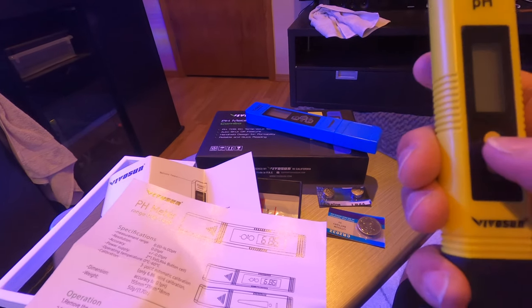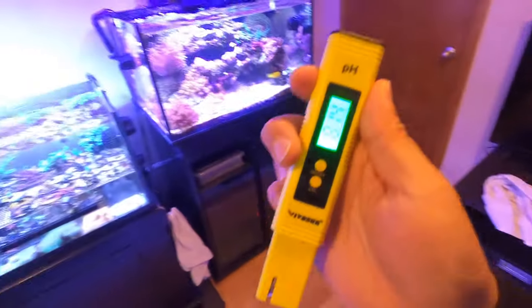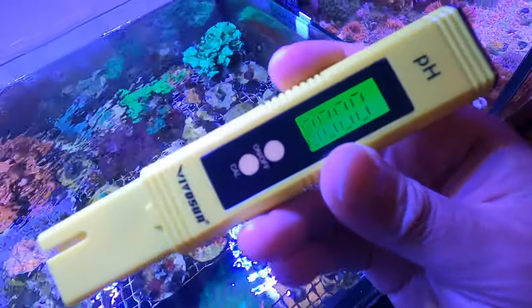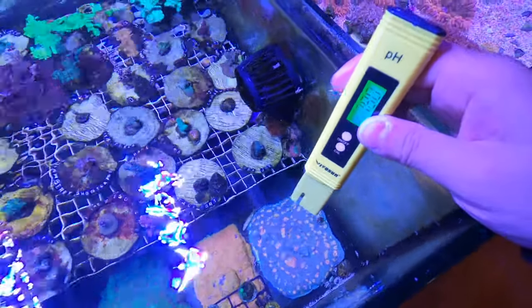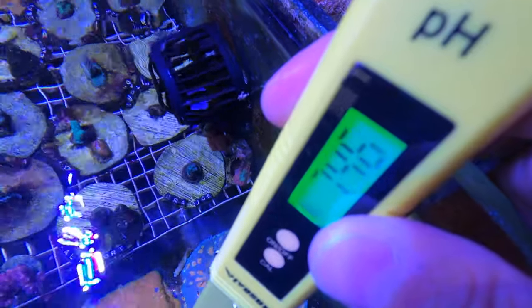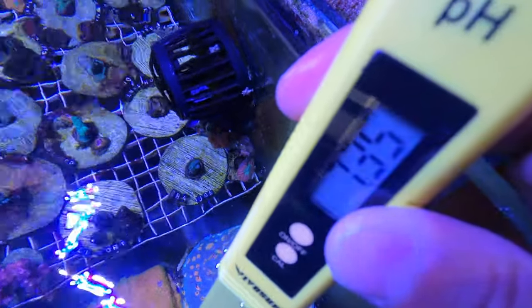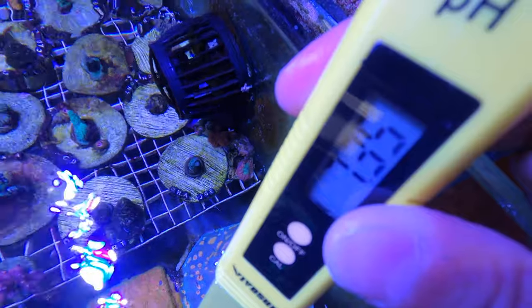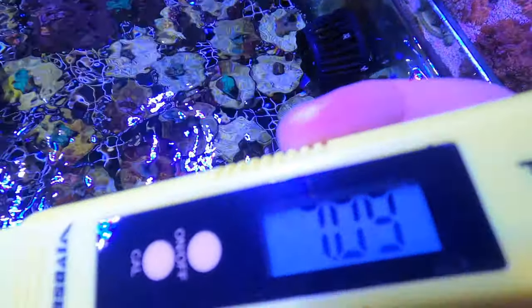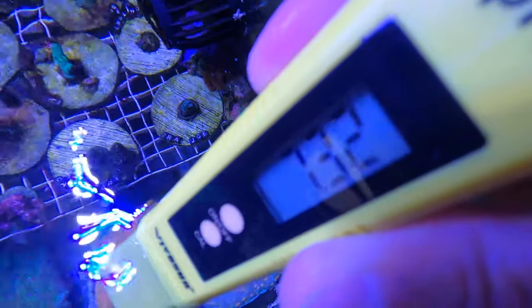For the pH meter, the instructions say to rinse it first — it's clean since it hasn't been used — turn it on, then immerse it in water for 30 seconds. As you can see the numbers are flickering a little bit. Looks like it's steadying. Right now it says 7.32.